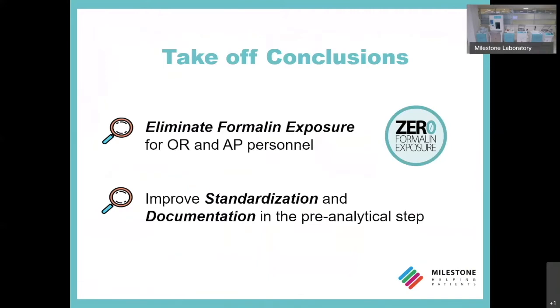Before leaving the stage to my colleague Marco, the takeaway conclusions of my presentation are these two. First, eliminate formalin exposure for operating room and pathology laboratory personnel. Today it is a must; we cannot go around it anymore. Second, for precision medicine and molecular diagnostic advancement, standardization and documentation in the pre-analytical step is essential.